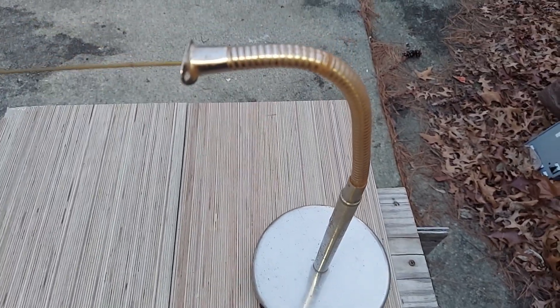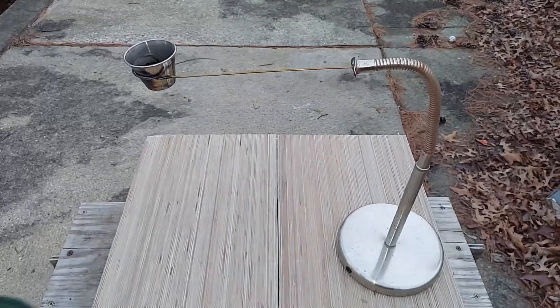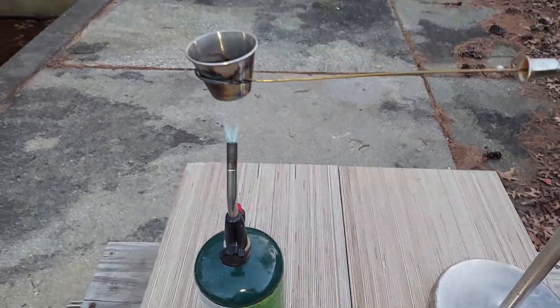This was a lamp stand with the gooseneck there. I jammed a hanger wire with the end formed as a little holder for this cup. The next step is to take a propane blowtorch like this, and set it right there and then step back.